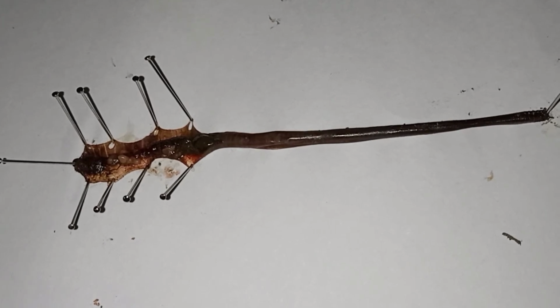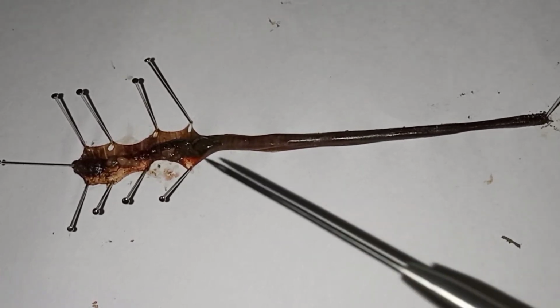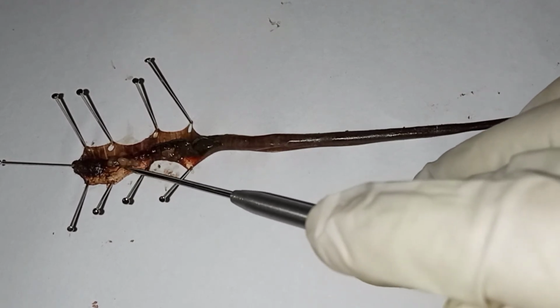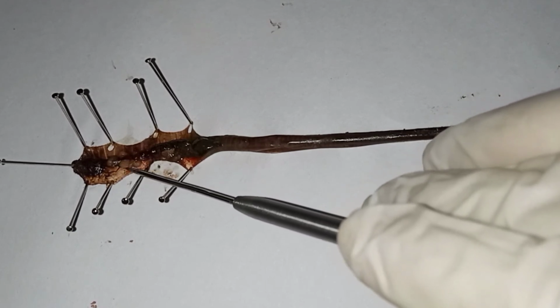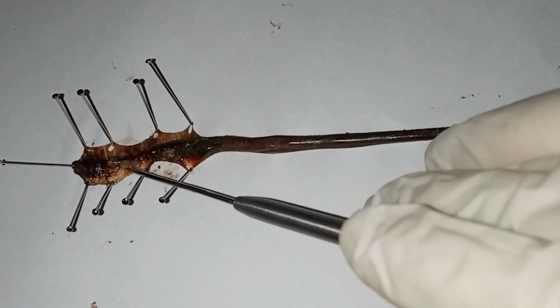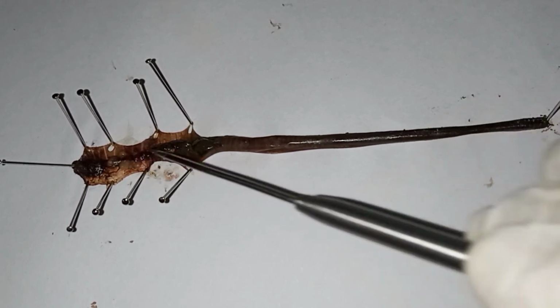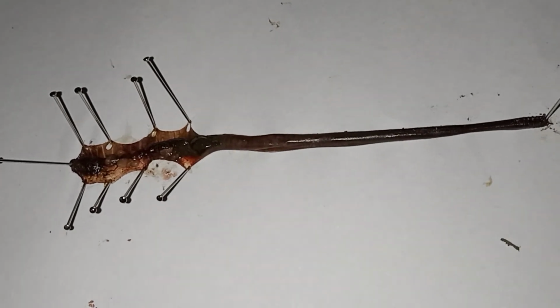Earthworms are hermaphroditic, which means they produce both male and female gametes. So we have here light-colored structures called the testicles that produce sperms. Behind the testicles, they also have the seminal receptacles that are responsible for storing sperms. Earthworms also have ovaries and oviduct that are located under the esophagus, so we cannot see them.